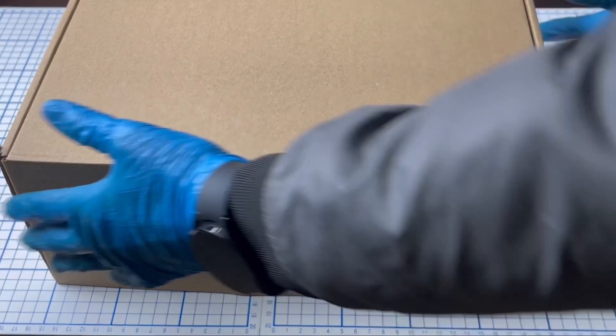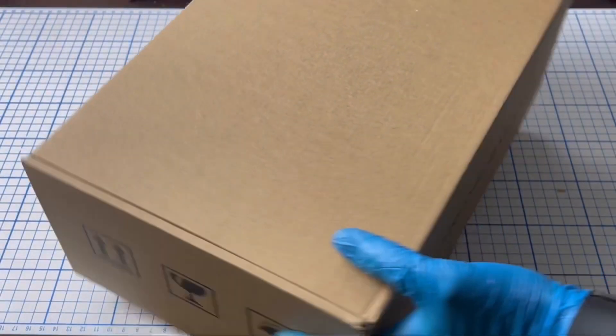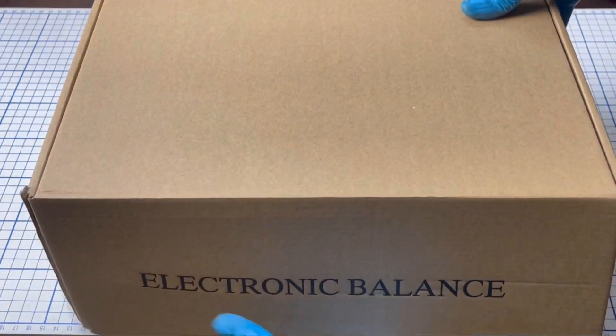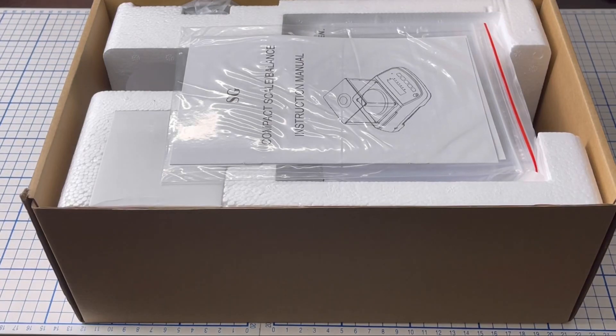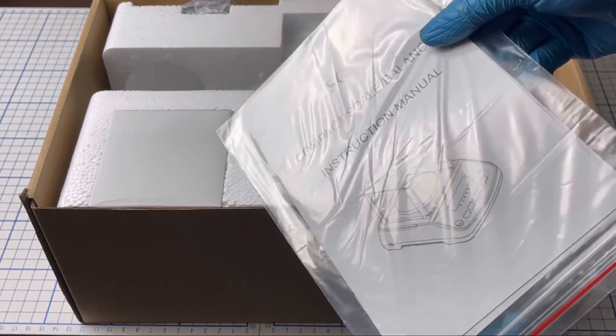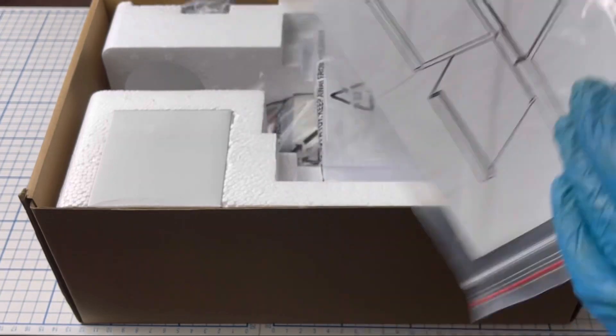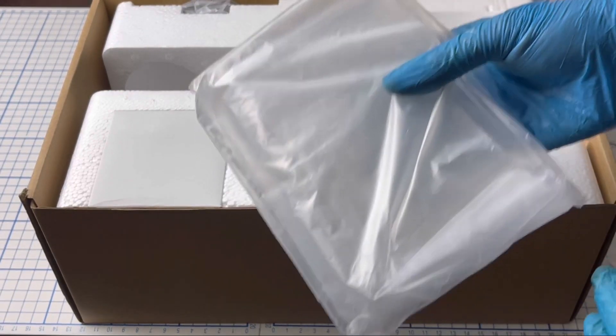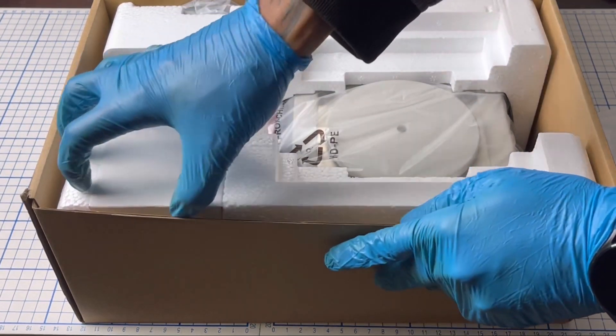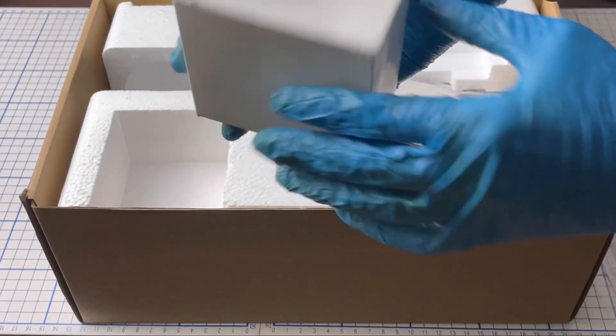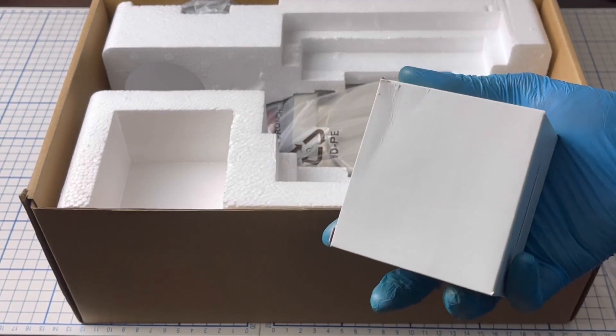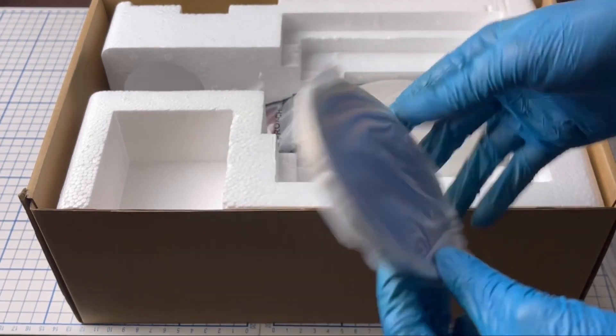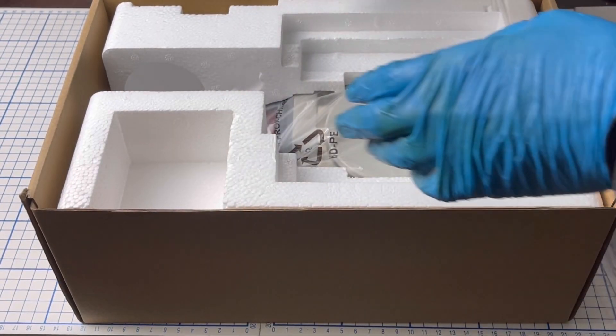Welcome to National Scientific Corporation. Today we are going to unbox a 600 gram GSM balance and cutter. This balance comes from Singapore, SUSA Global. You've already heard this name. This is the cover. Here is an adapter for charging and a plate weighing sheet.